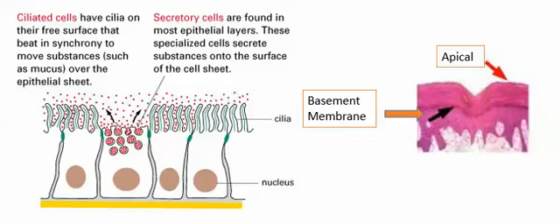We're taking a look at an example here, and you can see how there is an apical and basement part of this epithelial tissue. We're looking at ciliated cells and secretory cells, and notice these very important types of cells.